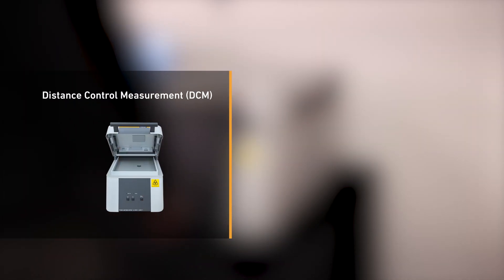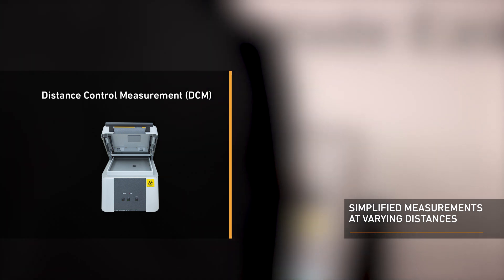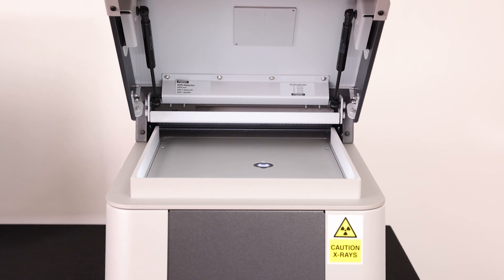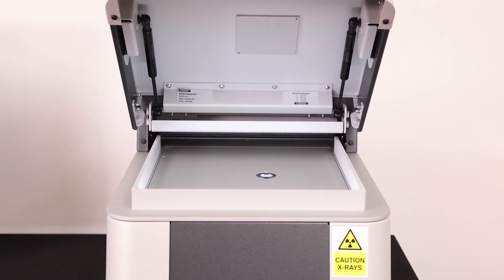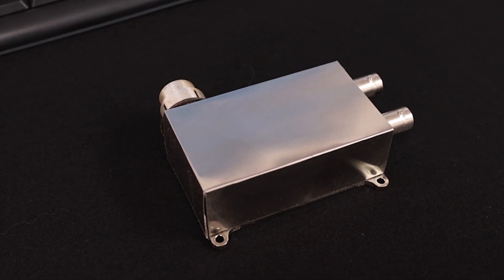The instrument also has a unique distance control measurement feature that can measure hard-to-reach areas on samples with complex geometries. The instrument has a spacious, fixed measurement chamber to fit all your samples. It has a modern silicon drift detector that achieves high accuracy and good detection sensitivity, and can analyse elements down to the nanometre range.